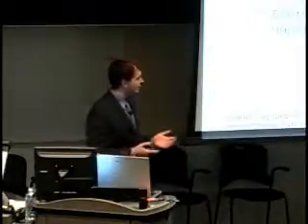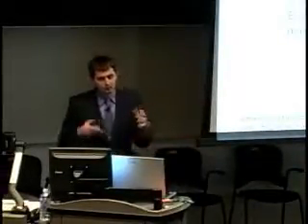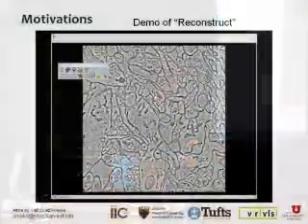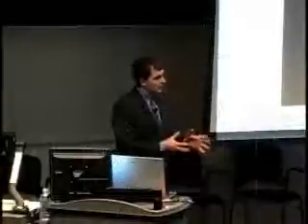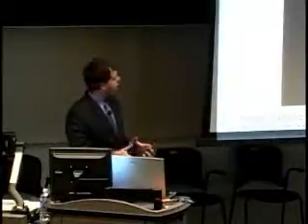And this means that any meaningful research that we want to conduct using this data will most likely involve the analysis of hundreds of gigabytes. It also means that any computer vision method that we want to apply on this data, such as registration, segmentation, stitching, visualization, will be computationally expensive, if not impossible, with today's computers. So this is exactly the motivation of our project. We want to make it easier for neuroscientists to be able to analyze this data and make discoveries about the connectome of the brain.